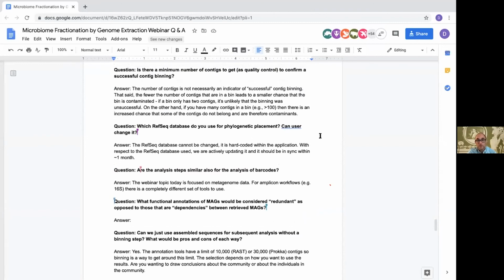You can do the tree building with RefSeq. You can use taxonomic classification with GTDB, which consumes RefSeq as well. Taxonomy is another whole can of worms, which we are trying to do some nice reconciliation in KBase. That's a work in progress. Stay tuned.